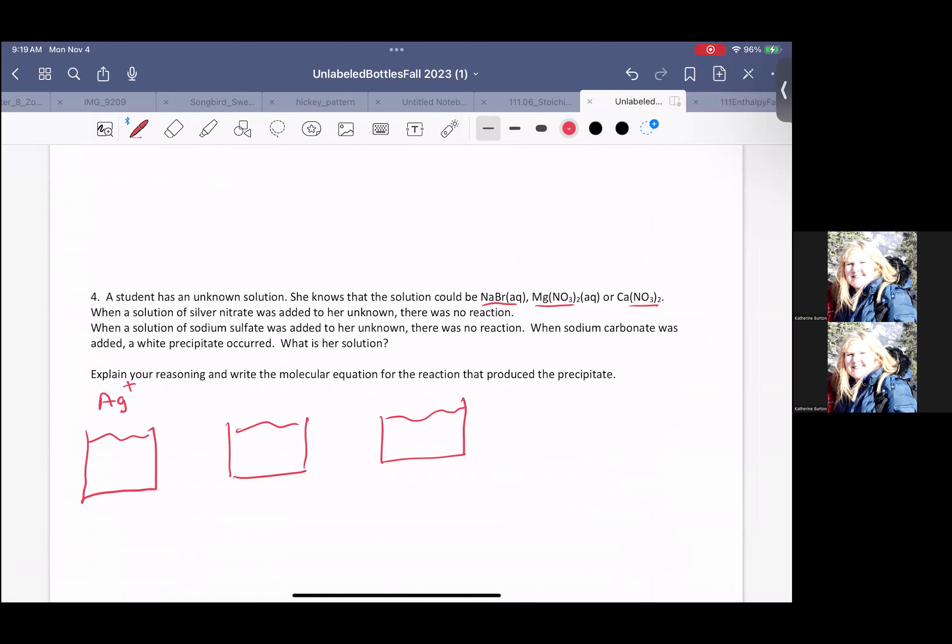So we have, we're going to add silver nitrate. We're going to add it to each of these three possible unknowns. Think about what a reaction is. Apply your solubility rules and make sure you explain your logic as to which your unknown possibly is.